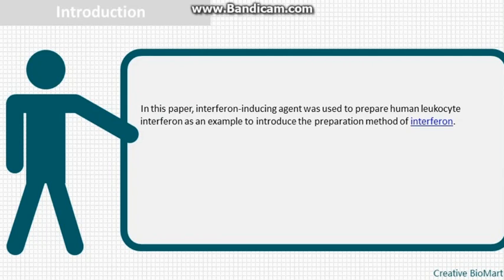Introduction. In this paper, interferon-inducing agent was used to prepare human leukocyte interferon as an example to introduce the preparation method of interferon.